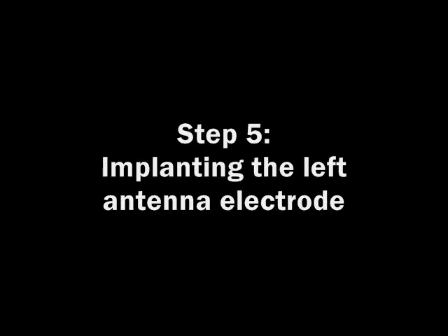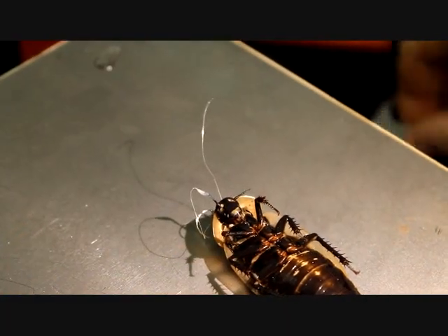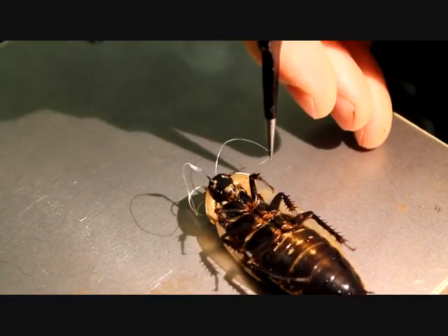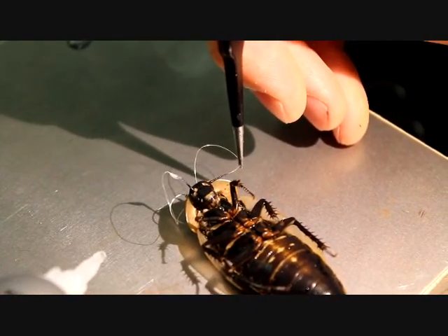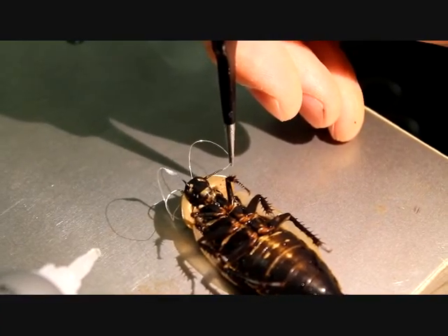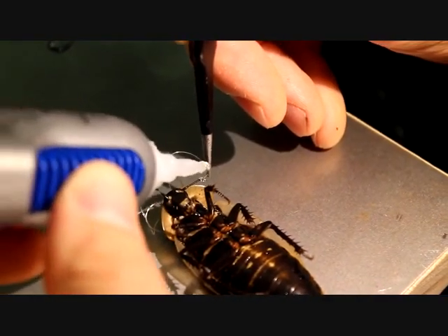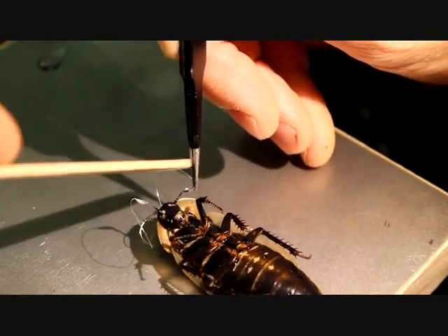In step five, you will implant the left antenna electrode. Again, take the cockroach out of the ice water and lay it on its back. Cut the cockroach's left antenna down to one-eighth to one-quarter inch long. Then grasp the left electrode and park it one millimeter inside the left antenna. Dab a bead of glue just above where the electrode is parked in the antenna, then use your fine forceps to park the electrode such that the superglue bead partially enters into the antenna approximately two to four millimeters. The superglue should polymerize immediately once it is inserted into the antenna — the point is to get the superglue just inside, otherwise it can easily fall out. Add a bit more superglue at the interface if needed, but avoid excess glue. When you have finished this step, one last time, place the cockroach back into the ice bath.